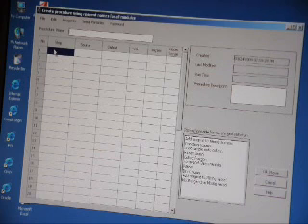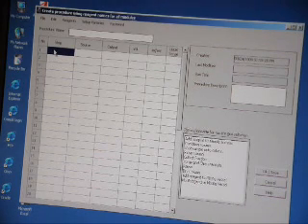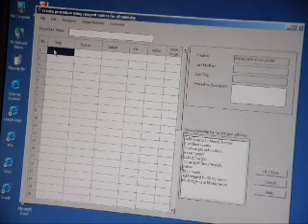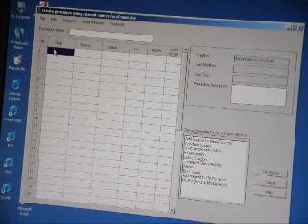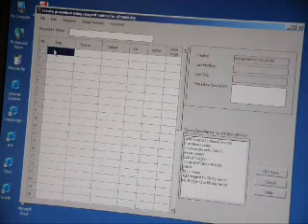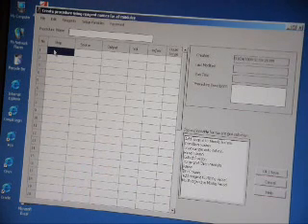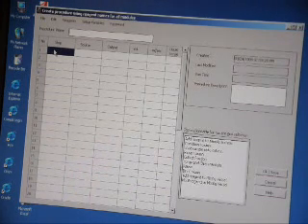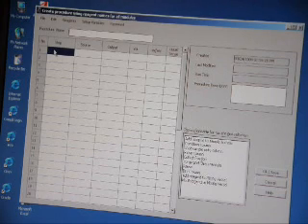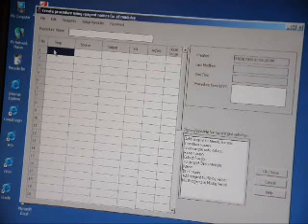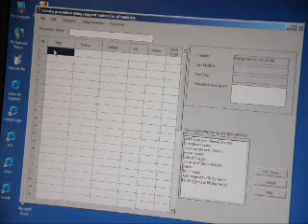And one of the other nice features is the Rapid Trace gives you some nice functionality for methods development. We have the ability to add different reagents into a mixing vessel and then use those. If you're doing methods development, you may know that you need a rinse solution that contains a certain percentage of methanol and water. But this would allow you to try various combinations without having to make those combinations on the lab bench first.